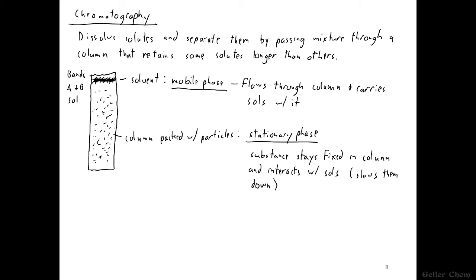So this picture here represents the start of the experiment. Everything's mixed together at the very beginning of the column. Nothing has started flowing. So we could say start, or we could be specific and say time equals 0. Nothing has begun yet. Now I'm going to erase some of this information and draw a column that represents the middle of this process. Let's quickly redraw another column, packed full of particles. But we'll label that this column represents later.